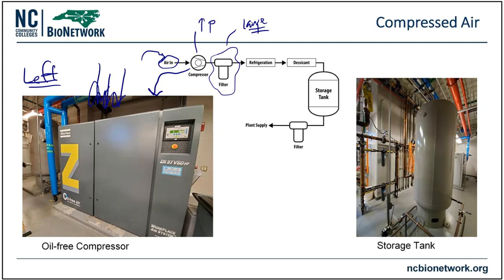But filters are going to be super, super tiny little pores. I mean, go back and take a look at the filtration types of lectures that we talked about together. So that filtration step is going to take out large molecules that should not be there. So for instance, things like organic types of compounds. Organic types of compounds should not be present. And those are sometimes very large, and those are sometimes harder to get out up until this point, and that filter system can actually take care of some of those for us, which is a good thing, right? So we often will get this preliminary filter that happens here.